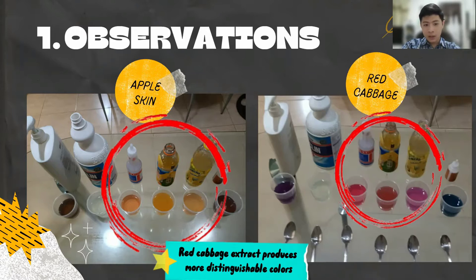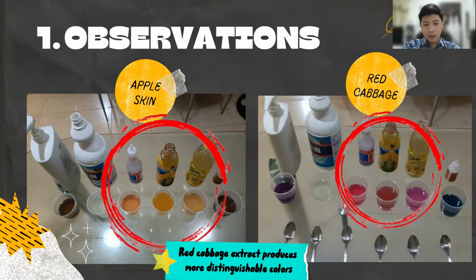Especially when I added the vinegar, lemon juice, and orange juice. As you can see, based on the apple skin extract, they produce very similar orange colors, while based on the red cabbage extracts, you can easily tell that it's pink, dark red, and light purple. This may cause inaccurate pH values when reading them.